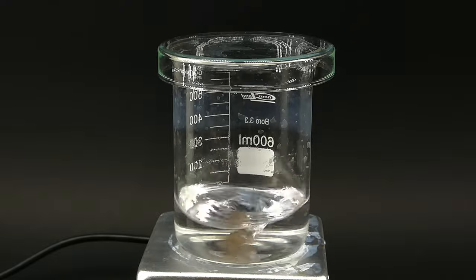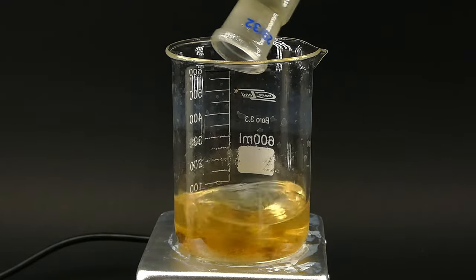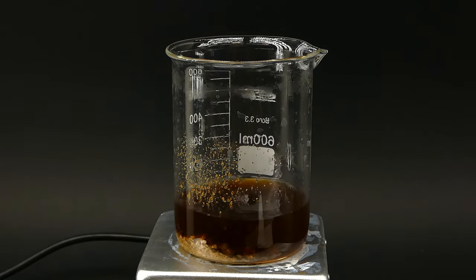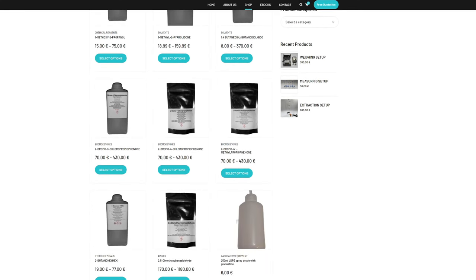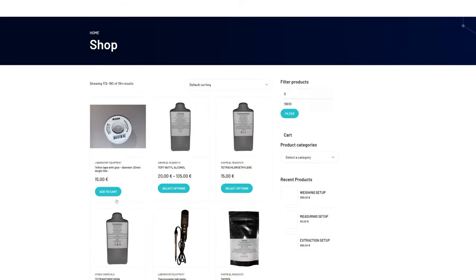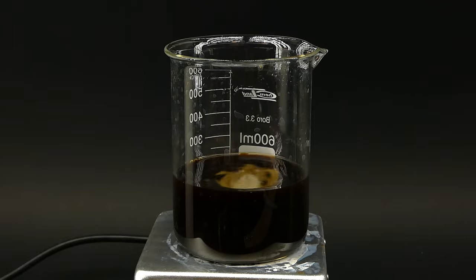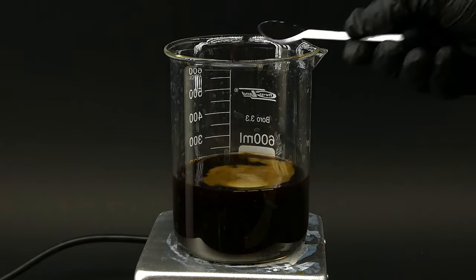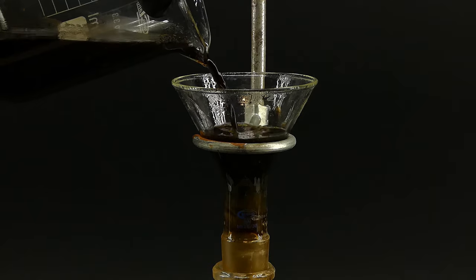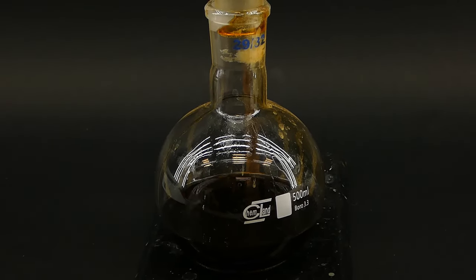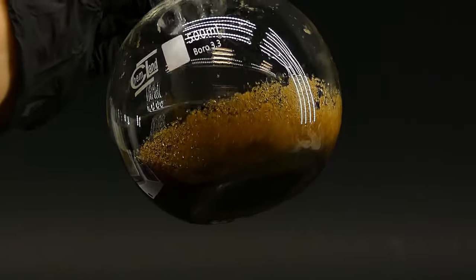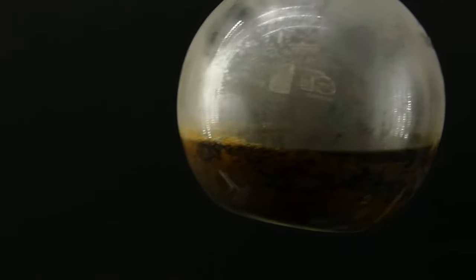To recover what little product I had left, I recrystallized it using ethyl acetate — I heated some of it until it started to boil and added all of my product to dissolve it. The ethyl acetate and other chemicals for the synthesis were provided by BM Chemistry, an online store that sells hard-to-get reagents and laboratory equipment. When everything had dissolved, I wanted to clean my product from the black tar and tried purifying with activated carbon, adding some into the mixture and letting it work for a few minutes. I then filtered everything through cotton, but the carbon didn't help at all. Fortunately, after the flask cooled to room temperature, some crystals appeared on its sides, so I cooled everything down in a freezer and vacuum filtered them out.